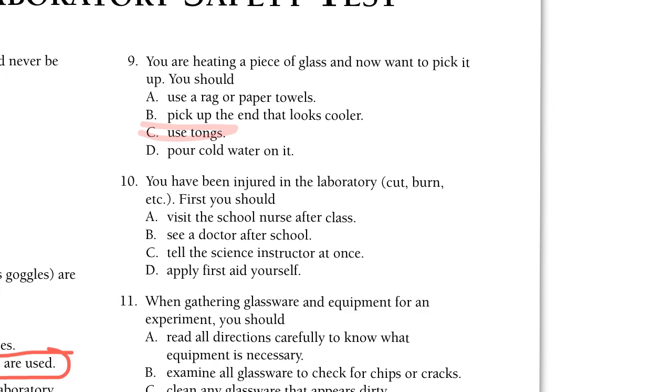10, you have been injured in the lab. First, you should A, visit the school nurse after class. B, see a doctor after school. C, tell the science instructor at once, or D, apply first aid yourself. E, put them out of their misery.